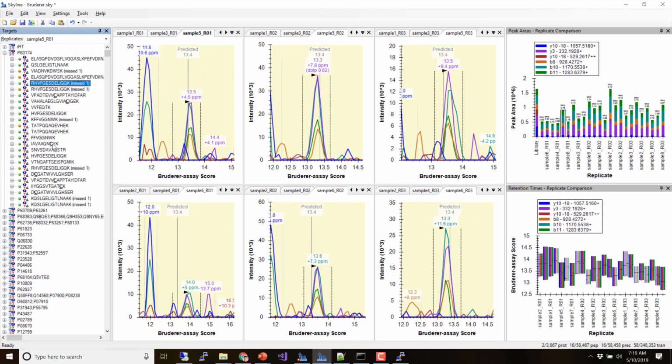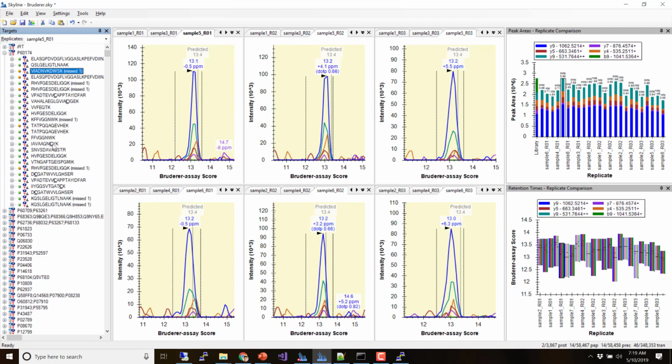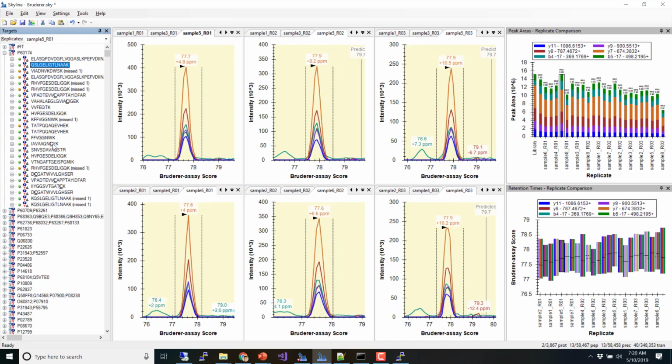There's a little bit of extra noise. If we want to go to the peptide level and have a whole clinical assay based on a single peptide and a single transition, just because that's the only thing they can get to fragment, then you have to do a lot more work. But anyway, I just wanted to do this with one protein. We definitely can't do it with all the proteins. Let's keep going to where we can get Mina a report.